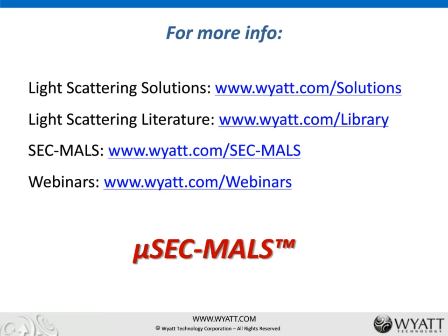All right, and are microDAWN and Optilab UT-rEX compatible with HFIP? Yes, they are compatible with HFIP or most organic solvents. And actually, that's probably a good application because HFIP is very expensive. And when you transfer the method from GPC to APC, you may save significantly in solvent consumption.